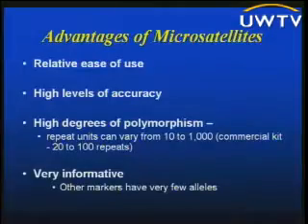So there are a lot of advantages to using microsatellites. One is that they are relatively easy to use. As I said, it's kit-based right now. It's a single PCR reaction. It's multiplexed. You add your DNA and off you go, and then you run it. The major problem, of course, is the analysis, which can be very cumbersome.